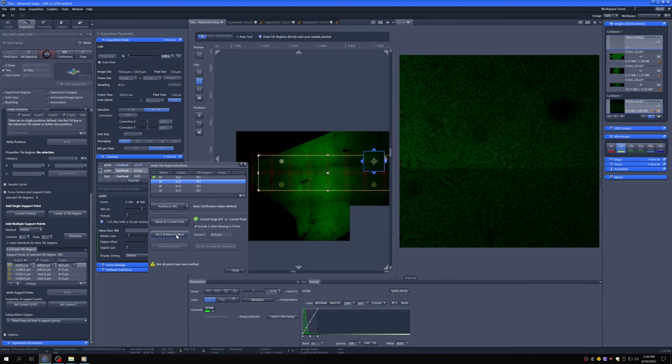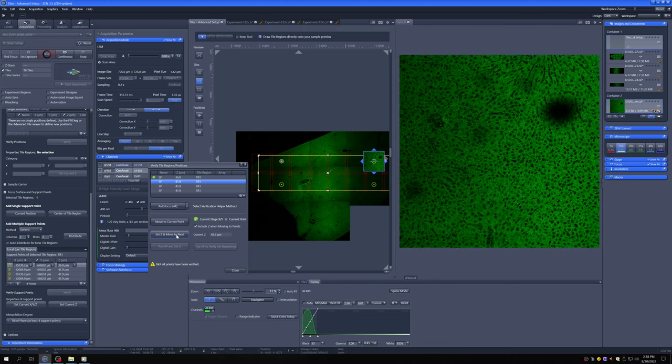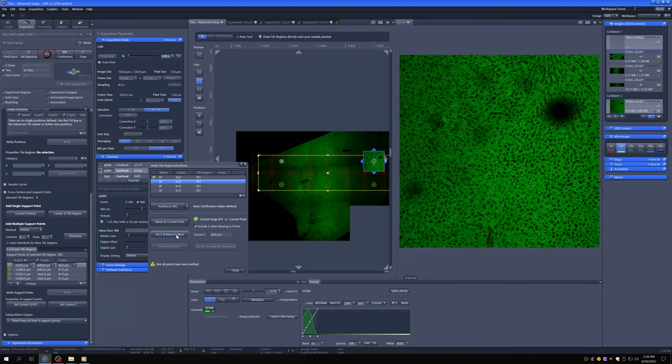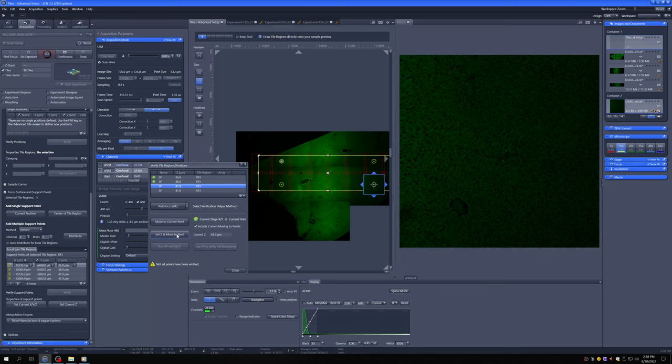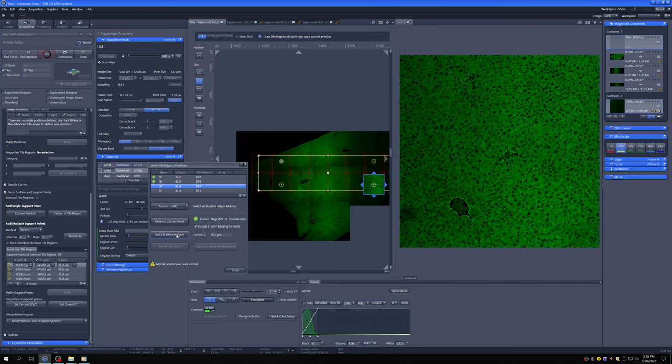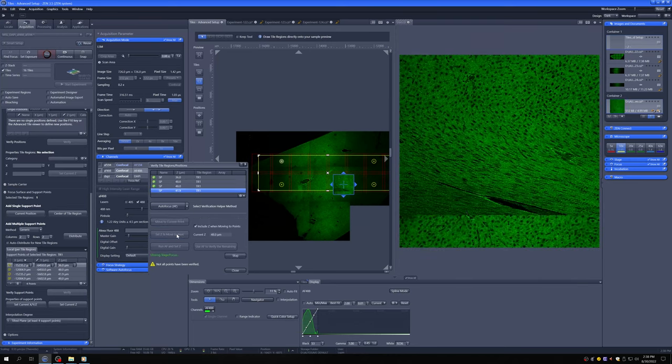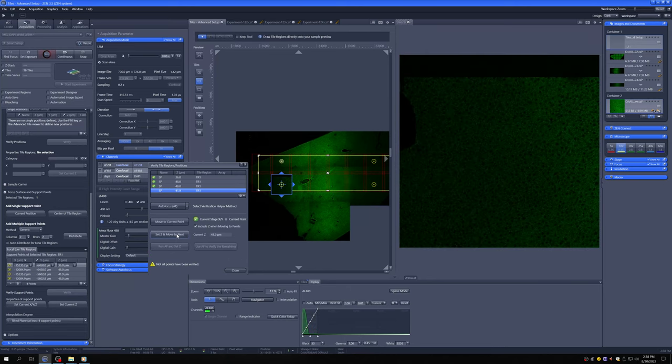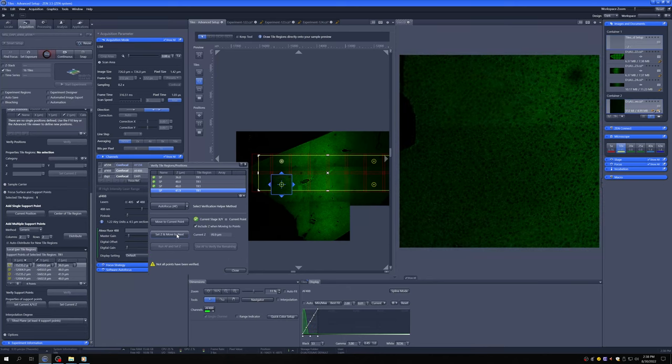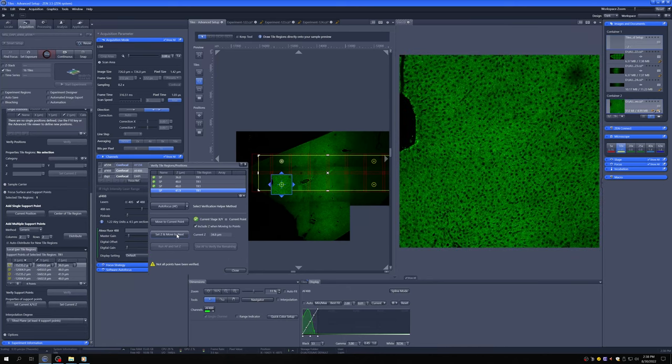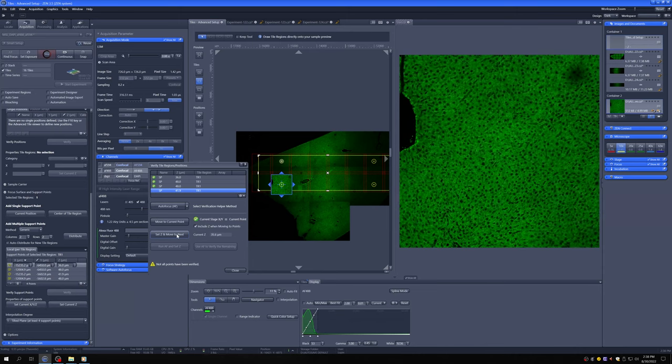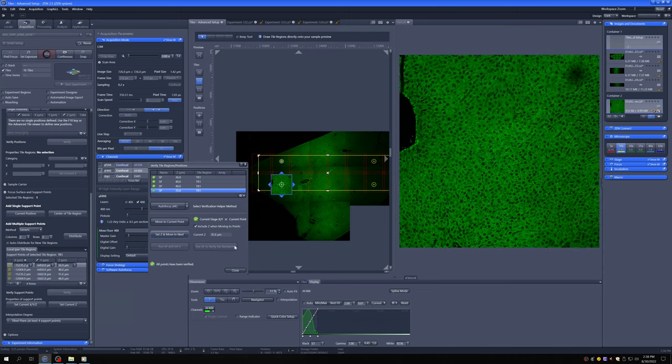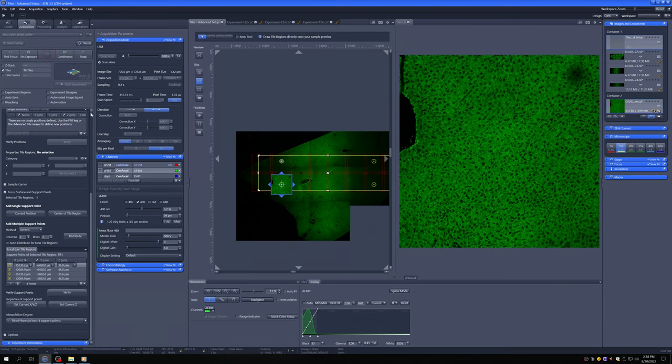So now we go to this one. And again, we want it as bright as it can be. Set Z and move to next. Set Z and move to next. We've verified all points. If I say close now and stop this, we have this focus map that it made.